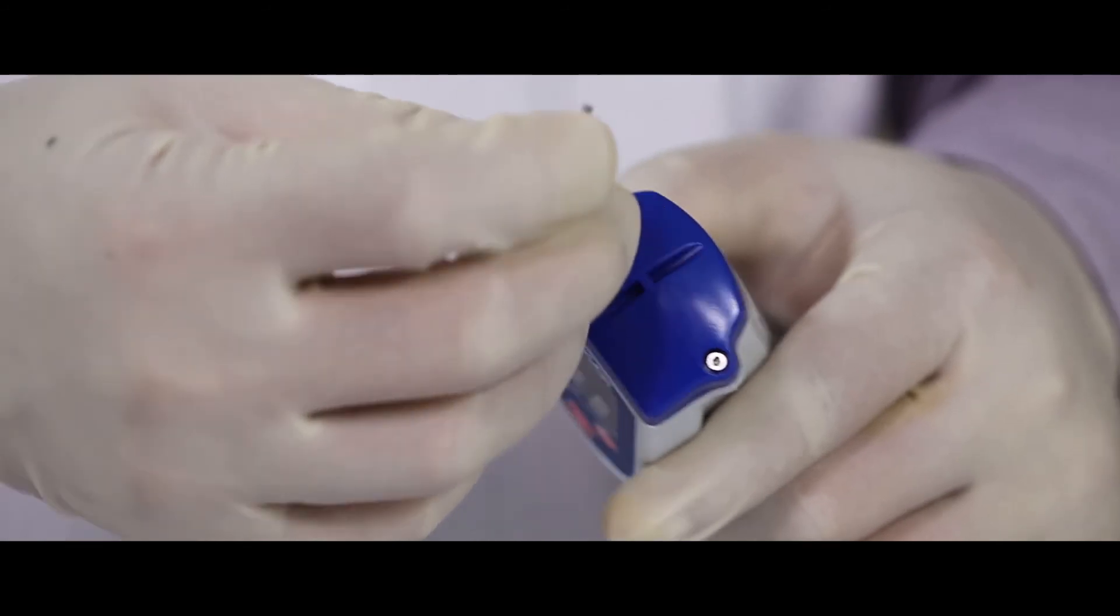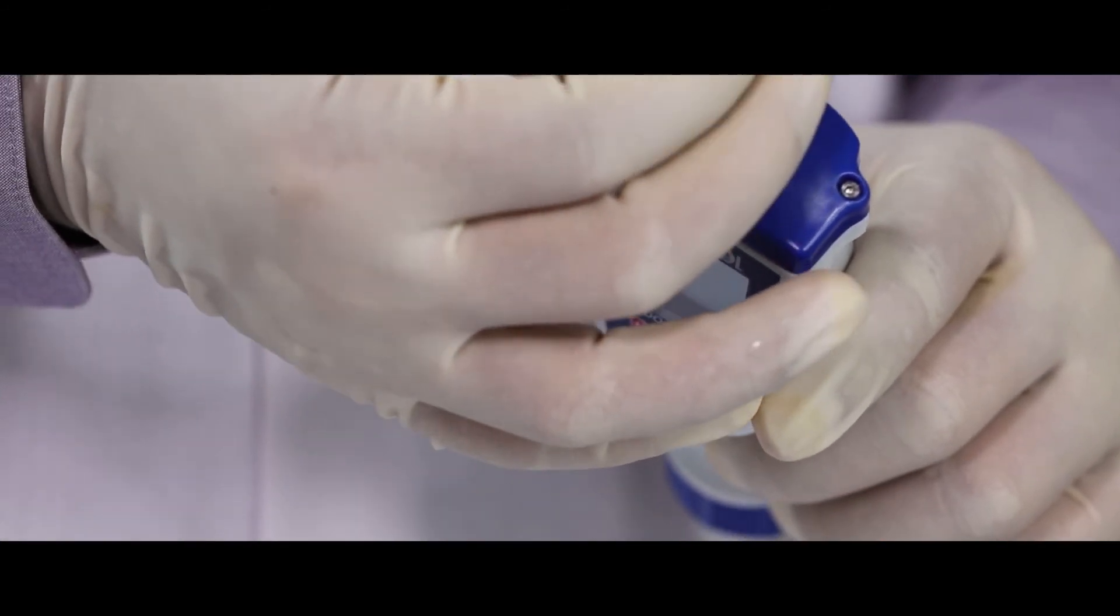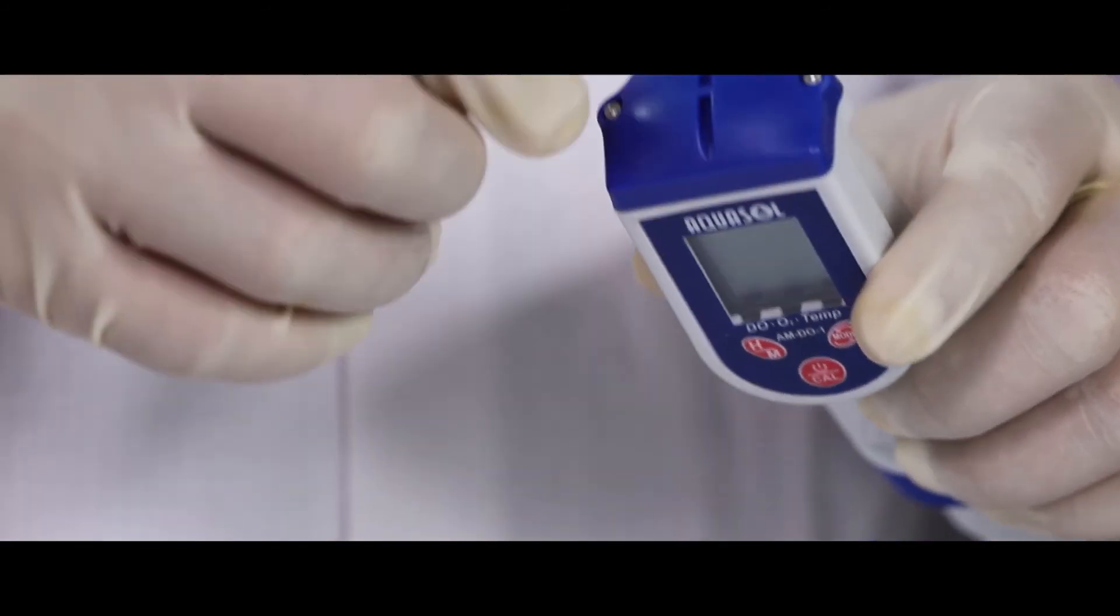Batteries are located on top of the meter. Note the polarities and replace the batteries.